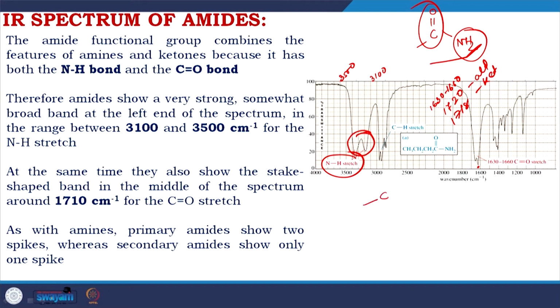As you know, the peptides in protein, which is our goal, have this amide group. We will see later there are amide 1 and amide 2 characteristic bands, which help experimentalists detect the secondary structure of the protein using IR spectroscopy.